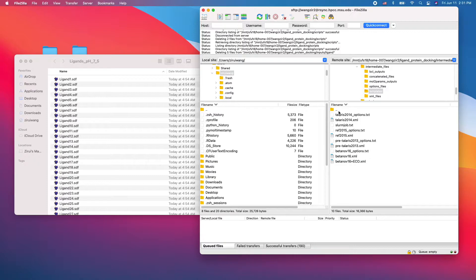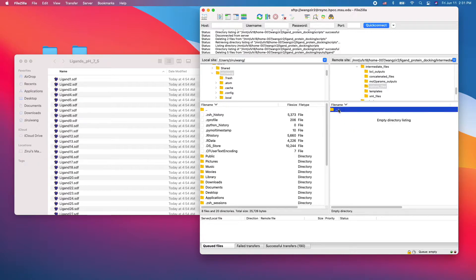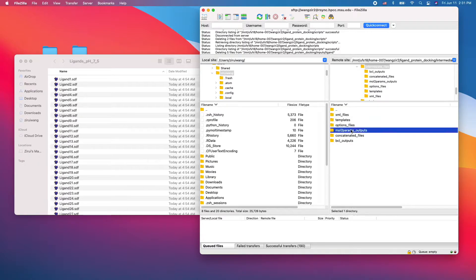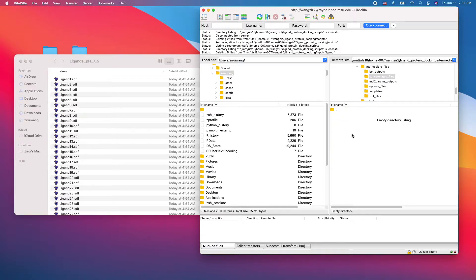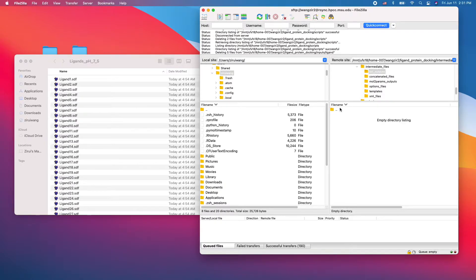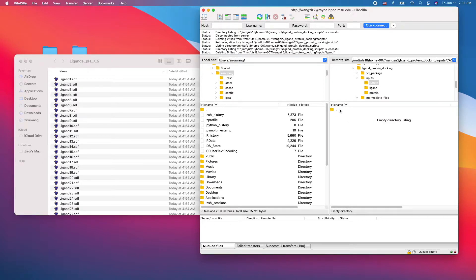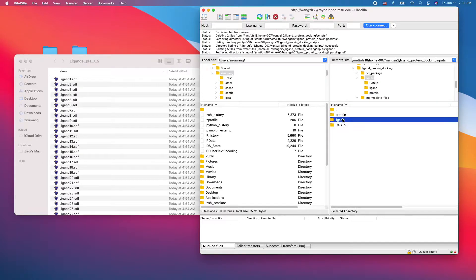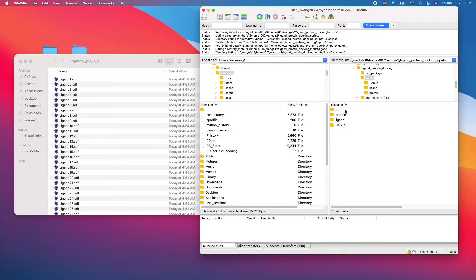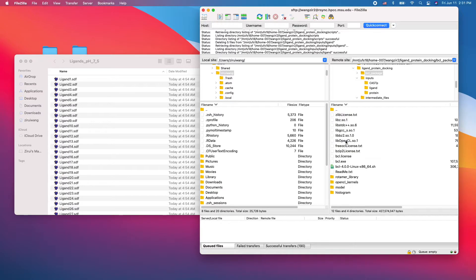Okay, these are templates. And just to make sure there's nothing in each folder. Input protein nothing, casp nothing, ligand nothing, and RBCL.